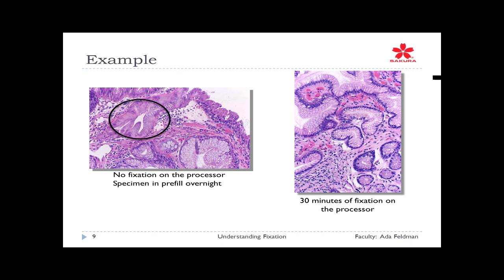It was brought in by the courier. So here was a very tiny specimen in a very small amount of fixative. It got to stay in the pre-fill container overnight. So with her busy schedule and needing to get the slides out to the pathologist as soon as possible, she logically thought, I do not need any fixation on the processor.